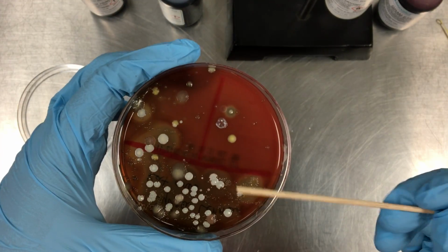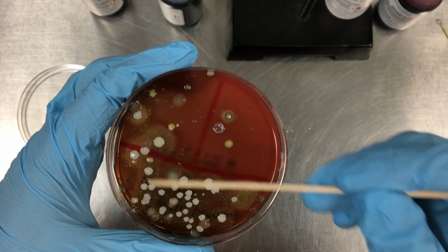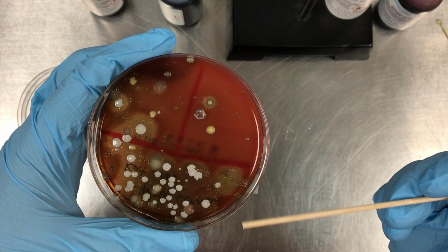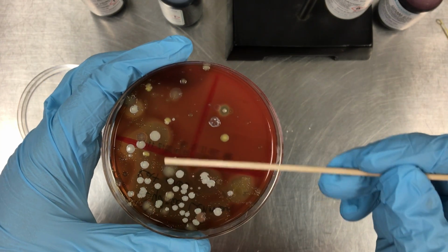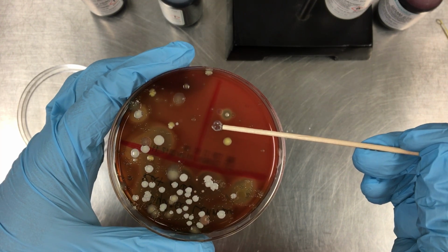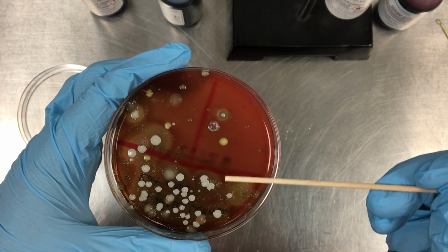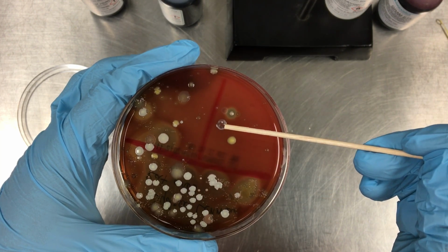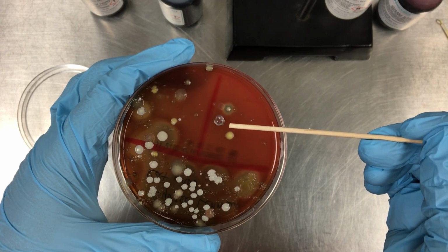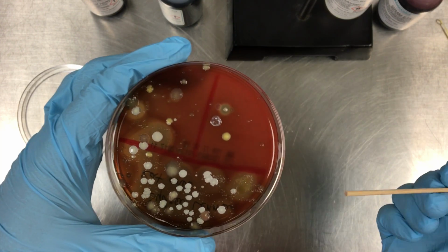So on this sample, you can see that these creamy white colonies are by far the majority bacteria. And so that's the bacteria that I'm going to want to sample and do a gram stain on. The best place to pick up a sample of that is over here. This colony right here, it looks a little different because somebody actually already has taken a sample of it, but that is the same creamy white color of these other colonies that we see, and it's completely isolated, not touching or overlapping any other colonies. So that's the one that we would sample.